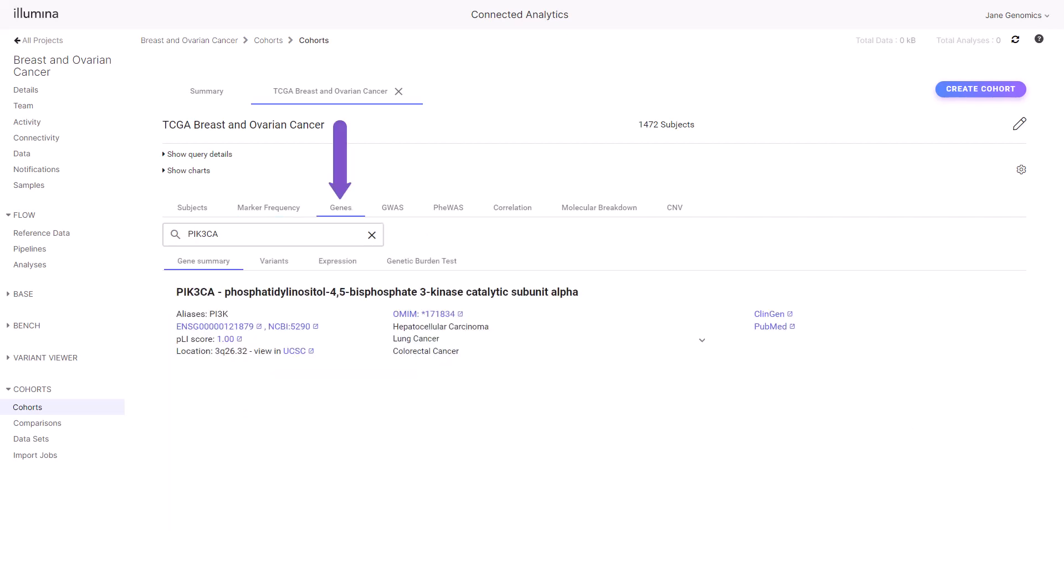The Gene tab with the Gene Summary sub-tab is active, listing information and links to public resources about PIK3CA. Select the Variants tab to view an interactive legend and set of analysis tracks.